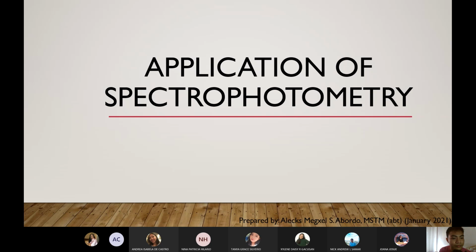Okay. So hopefully in your lecture, you were able to discuss spectrophotometry na, no? Hopefully nadaanan nyo na because kung hindi pa, medyo magagahol kayo sa time, no? But yun. So in your lecture, ano sinabi doon about spectrophotometry? This method of chemical analysis is used to quantify substances based on how they interact with light. Okay? So apparently kasi, yung light natin, they interact with matter.